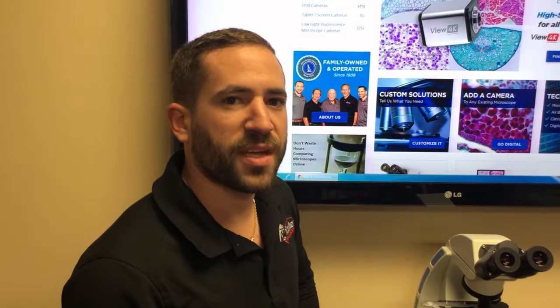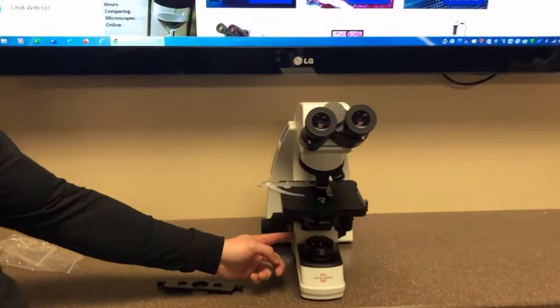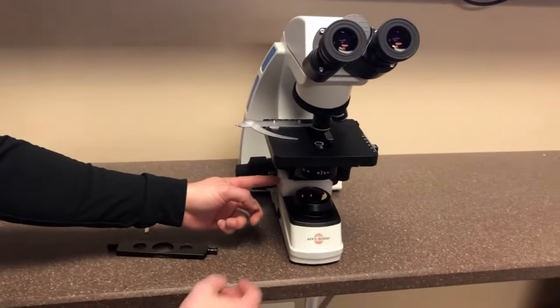This video is to show you how to set up the AccuScope 3000 LED SPH phase contrast microscope. First, remove the foam block underneath the microscope focus mechanism.